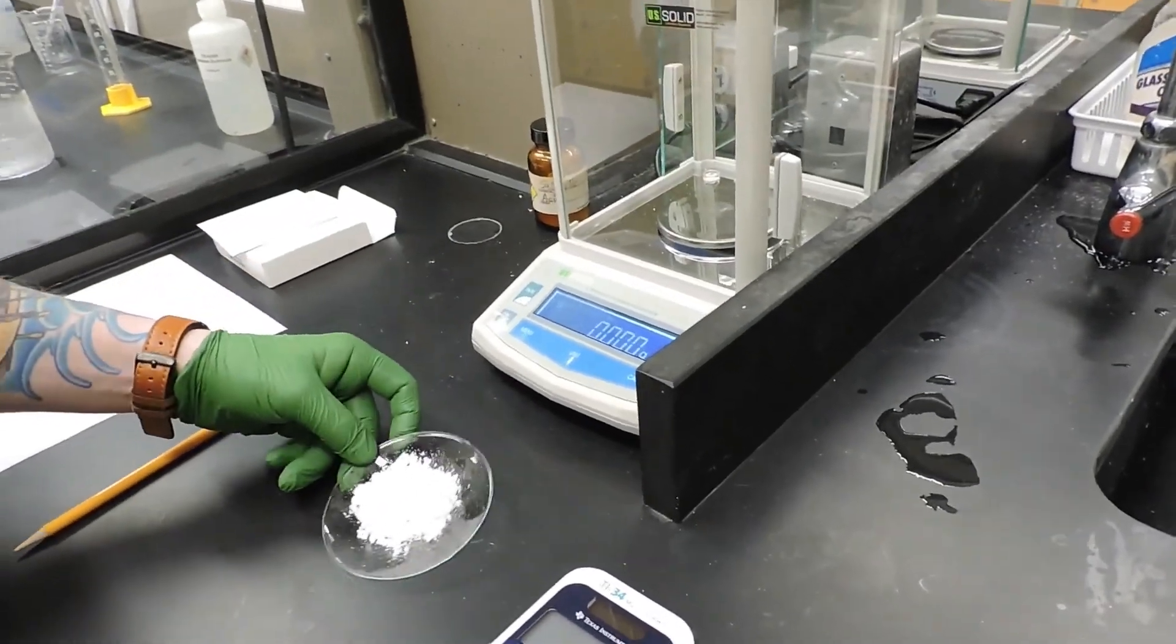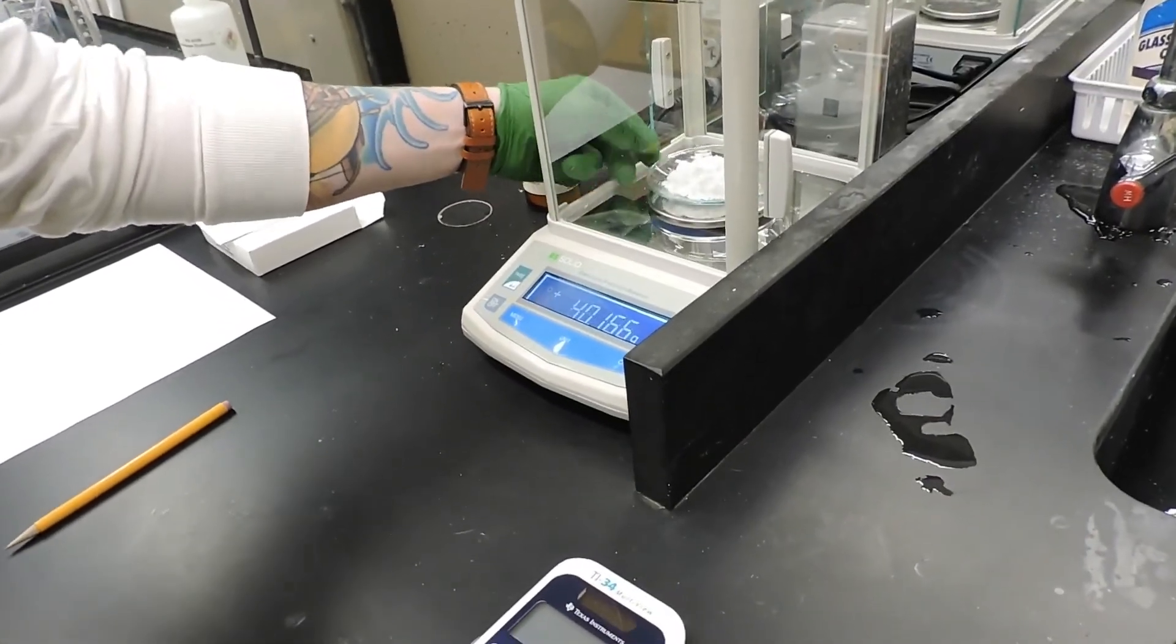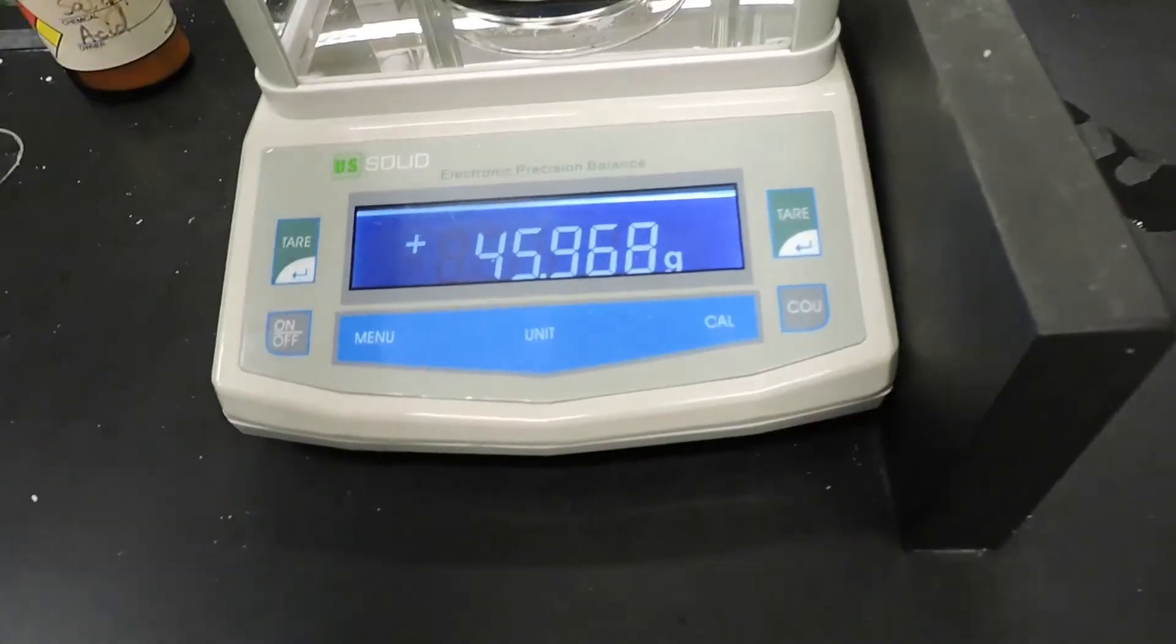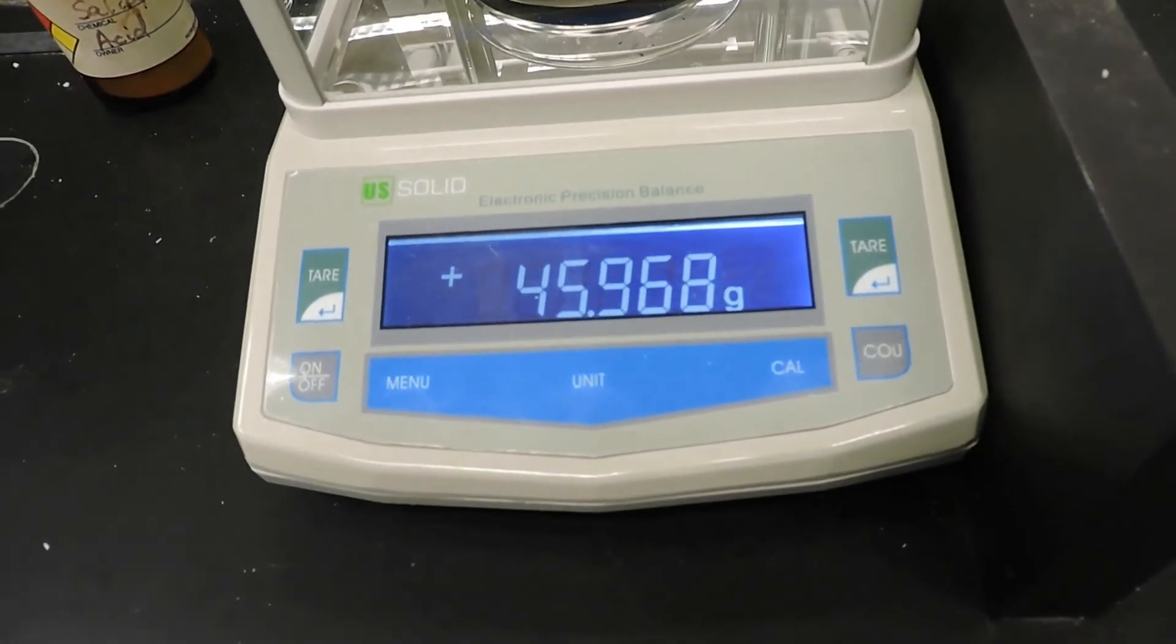Now we're going to weigh the alum that we collected with the watch glass. That mass is 45.968 grams.